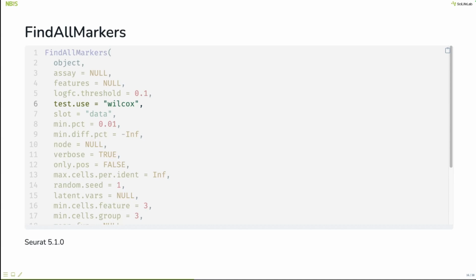If you integrated them, you've removed a lot of the differences. What I was going to add before was that you can also adapt this to correct for batches, and I'll show you how to do that in a later step. So if you needed to integrate in order to remove batch effects, you can add that as a part of your differential expression analysis.